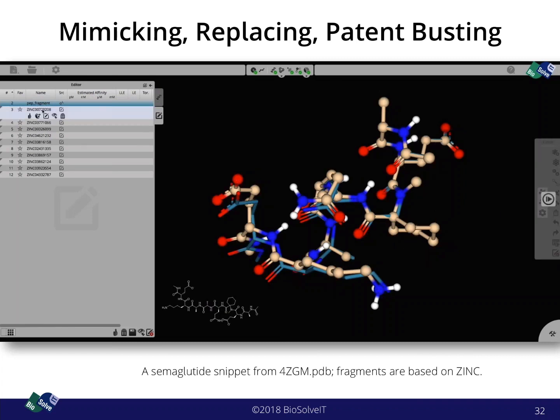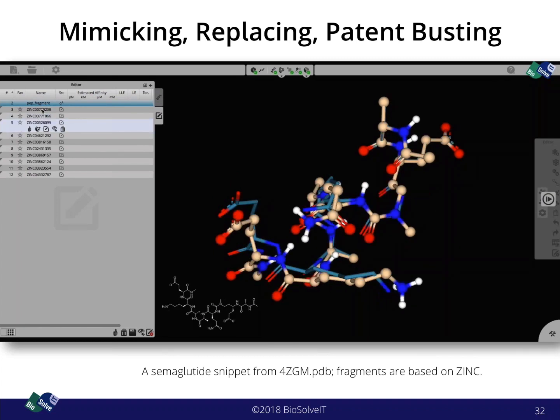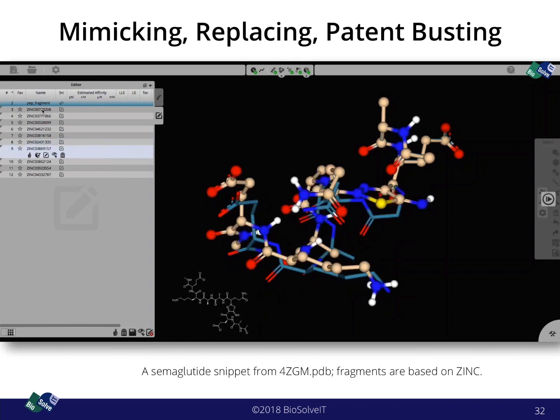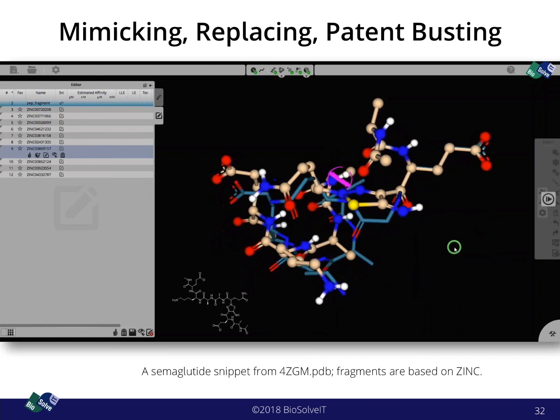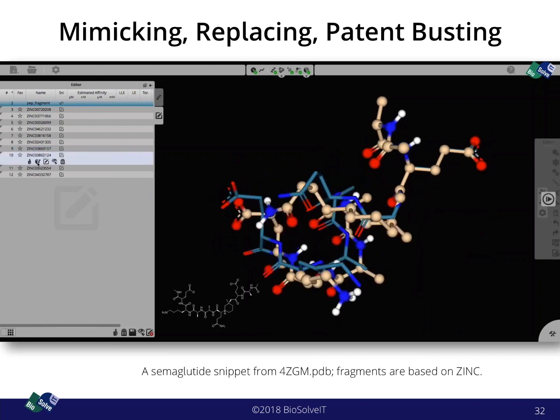And then you can navigate through the list of solutions that is made in such a way that the part which has been inserted should not distort the rest of the molecule. So try to minimally invasively replace a part and come up, for example, with a heterocycle that leaves the other parts in place.